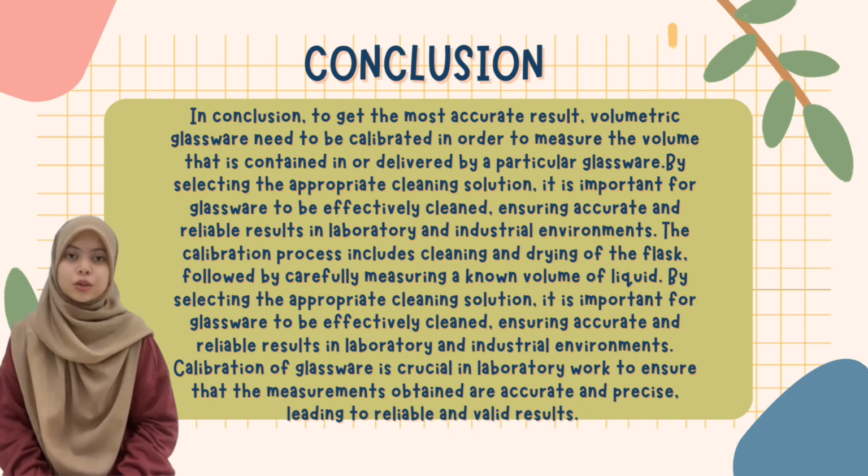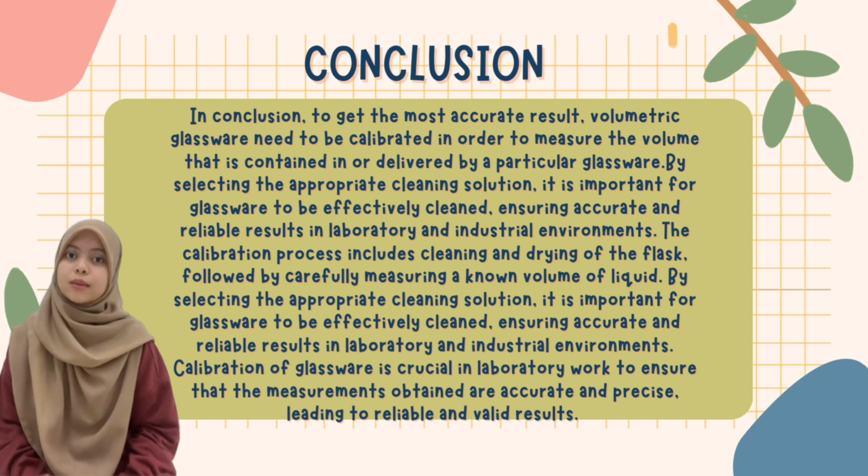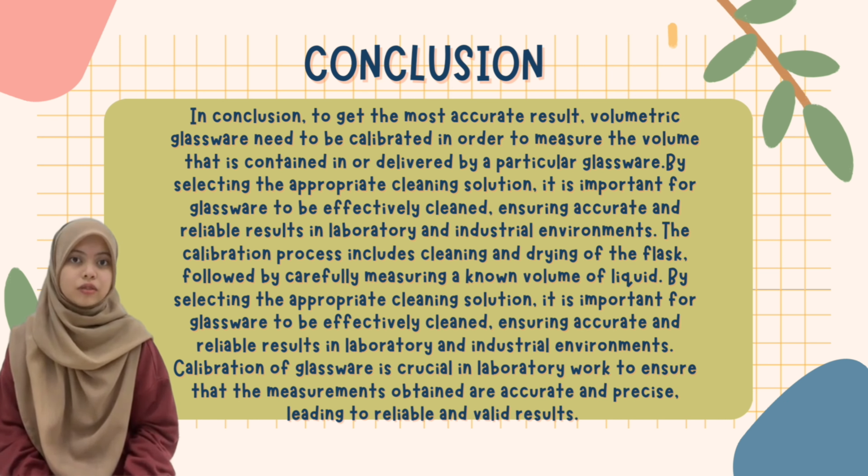In conclusion, to get the most accurate result, volumetric glassware needs to be calibrated in order to measure the volume that is contained in or delivered by a particular glassware. By selecting the appropriate cleaning solution, it is important for glassware to be effectively cleaned, ensuring accurate and reliable results in laboratory and industrial environments.